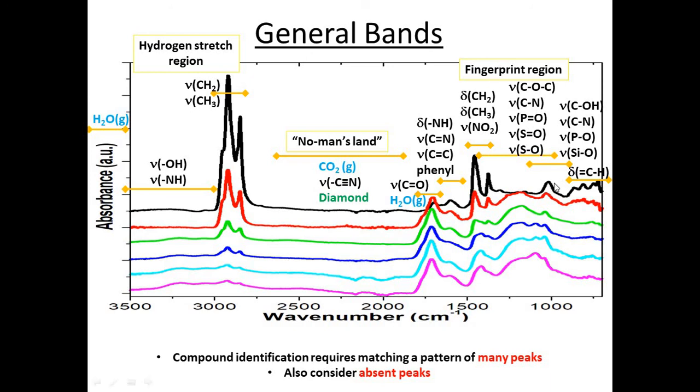For instance, this is a spectra of bitumen. The literature often attributes this peak right here to sulfoxides, and there's some good work demonstrating that this peak is sulfoxide, but there is a problem here. This peak is in the exact same location as you might find a silica peak. And silica is sand. Silica is dirt. Silica is rock. Silica is everywhere. Silicon and oxygen are two of the three most common elements in the Earth's crust.